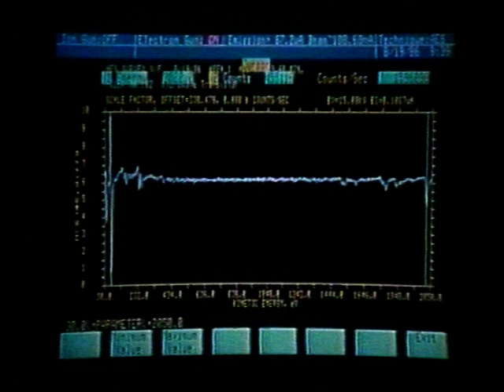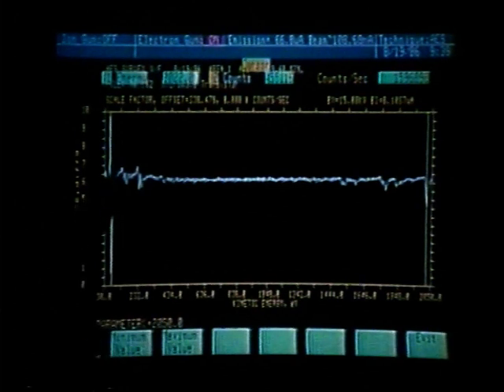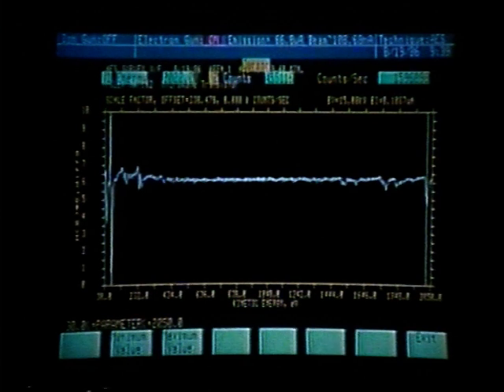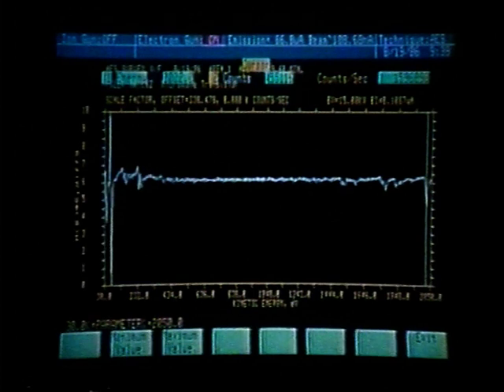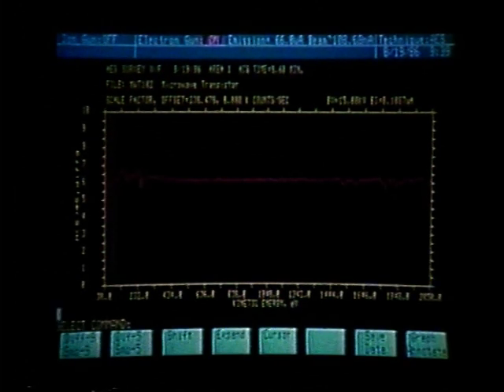By going to the handbook, I can match up the high energy and low energy peaks and determine that all of the peaks represented on this graph belong to gold. Now that we have identified the elements on area number 1, we can exit the cursor mode and re-display area number 2.